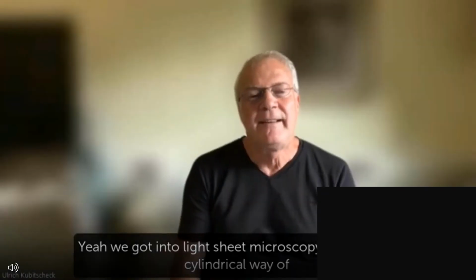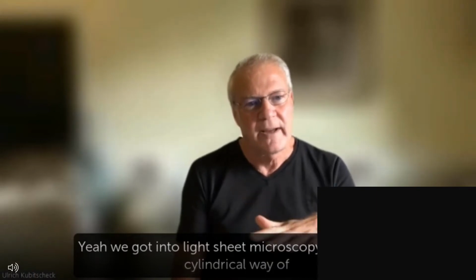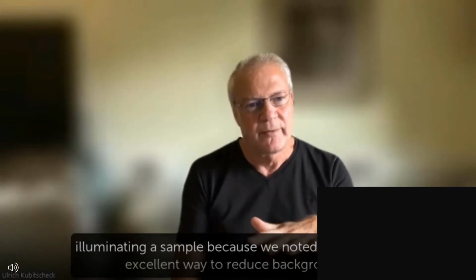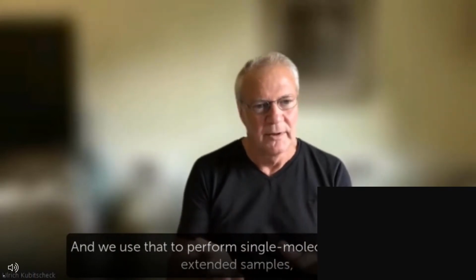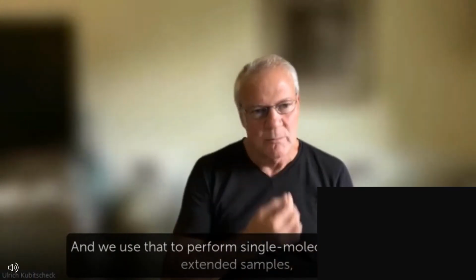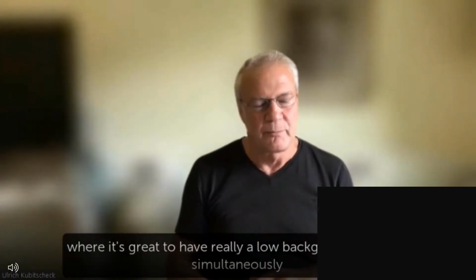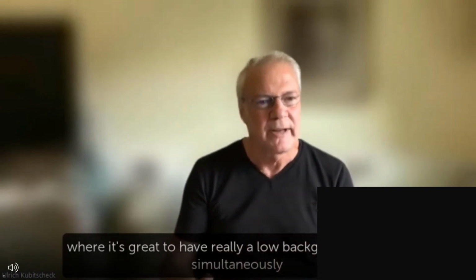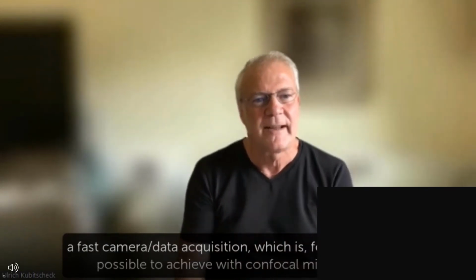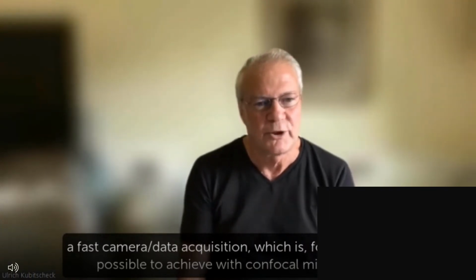Yeah, we got into light sheet microscopy by using the cylindrical way of illuminating a sample because we noted it's simply an excellent way to reduce background. And we used that to perform single molecule imaging in extended samples, where it's great to have really a low background, but also simultaneously a fast camera data acquisition, which is, for example, not possible to achieve with confocal microscopy.